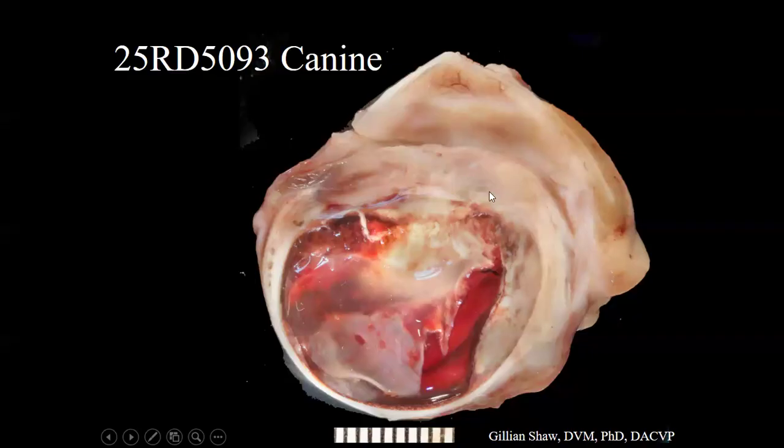And then it kind of blends with this tan tissue here, which is in the supraciliary and suprachoroidal space. This is the detached retina. And then we have hemorrhage in the subretinal space and in the posterior chamber. And I think this is the anterior chamber right up in here, which is a little bit hard to distinguish. And there's white tissue on the anterior surface of the iris. So we do have evidence of a mass in this eye. The gross notes say the iris, ciliary body, and choroid have a tan mass that was extending through the sclera into the orbital tissue.